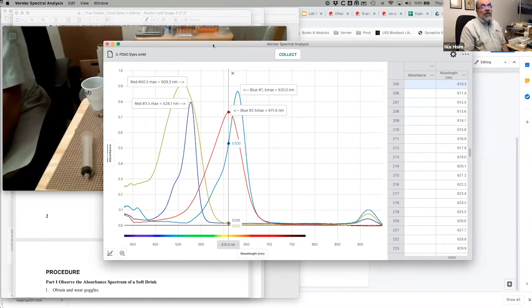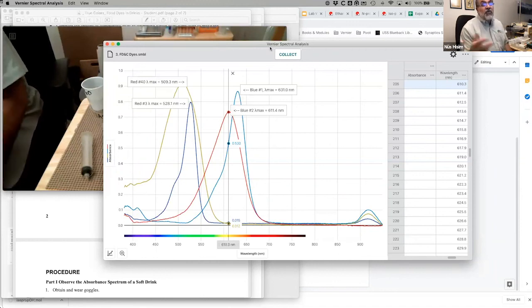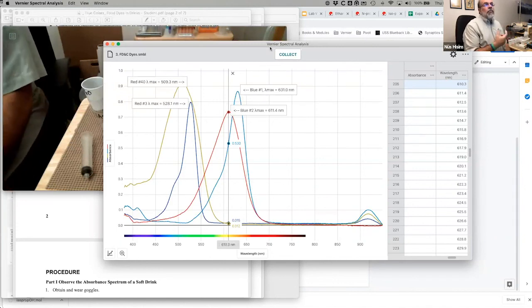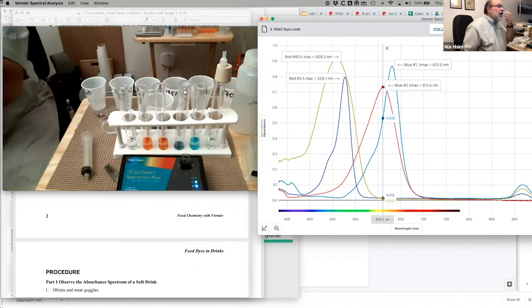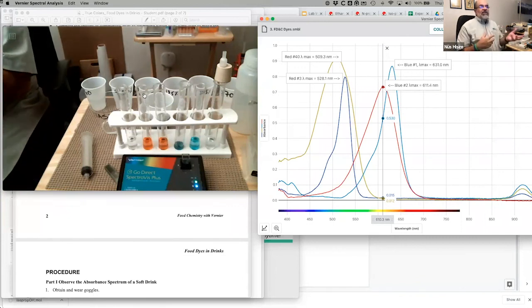And that's a good point, Nick. Probably should have. But I was running the ones with the mixture, and they're different, right? So technically, I should run the exact same mixture as the blank. Nick points out, shouldn't you be using the blank as the alcohol mixture for that particular test tube? And he's absolutely correct. You'll probably find it won't make a huge difference, but it's good technique, and the right thing to do is use the same solvent that you use to create the mixture as the blank. What Nick is pointing out in the chat is, I used this one here, which was the 17.5%, so I should have used that as my blank. And if I do the red and I use this one, well, that should be the 4.38. So I should blank it each time that I do it.